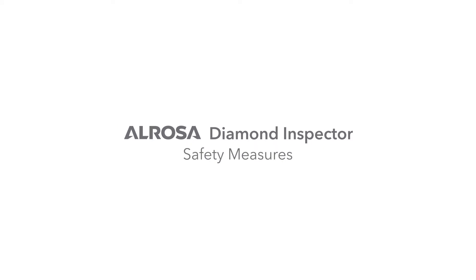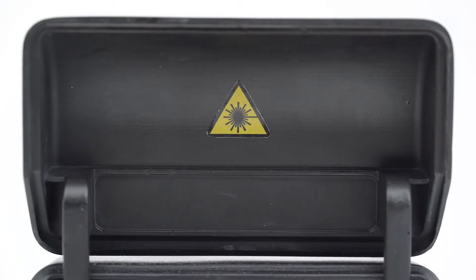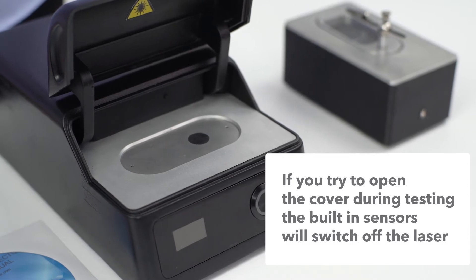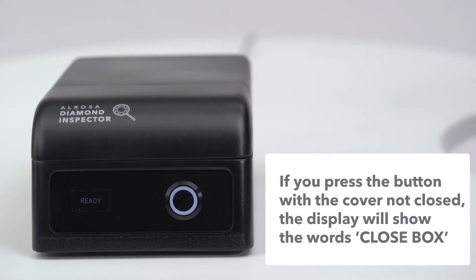Safety measures. A laser is used inside the device, so you should not open the device cover during testing, as laser radiation is not safe for your health. However, sensors built into the device cover will switch the laser off if you try to open the cover during testing. If you press the button when the cover is not closed, the display will show the words 'close cover.'